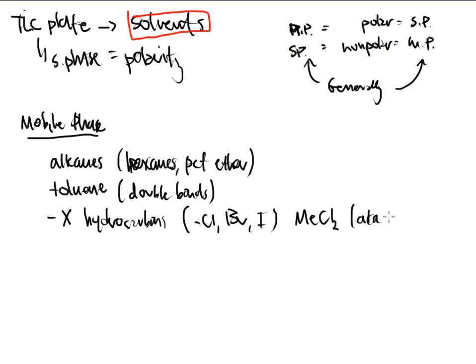This is also known as dichloromethane, and that has its own abbreviation as DCM. We're increasing polarity a little bit there because we've added a halogen, and that increases the electrons that are present. Each halogen has 3 sets of electrons around it when it's attached to a compound. Chlorine does, so does bromine, so does iodine. You learned that in organic chemistry, hopefully.